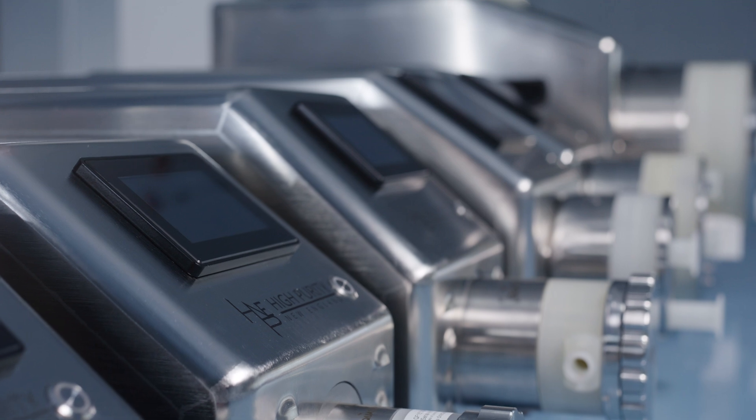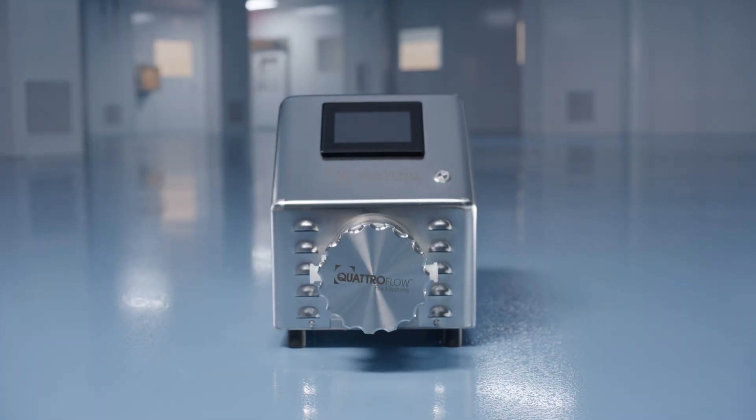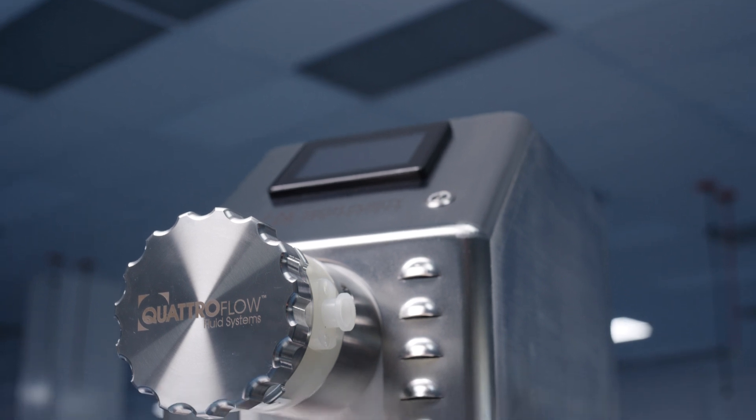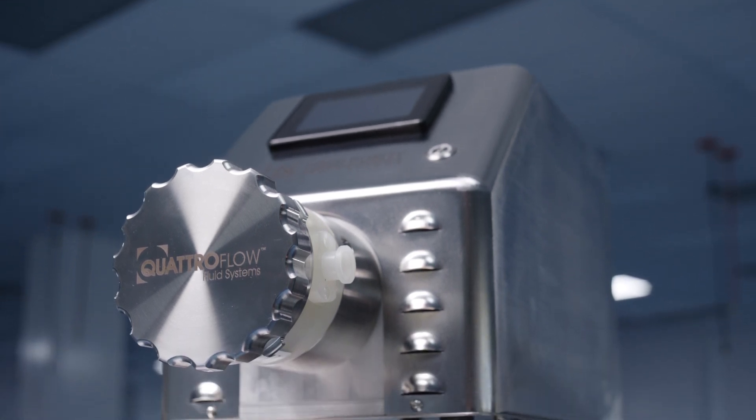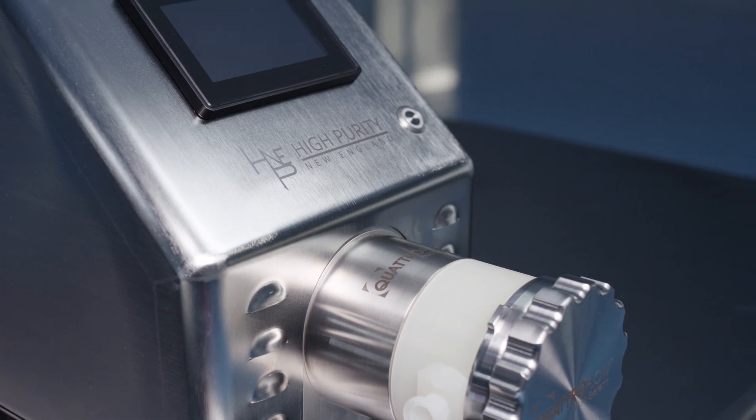Introducing the latest version of our best-selling fully integrated smart pump, Flomax Pro. From benchtop research and development through to full-scale manufacturing, Flomax Pro pumps allow increased flexibility throughout your process.